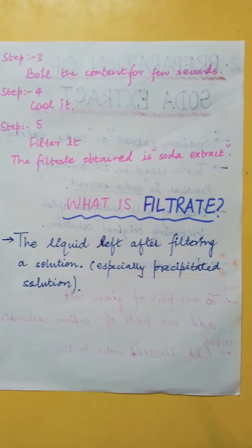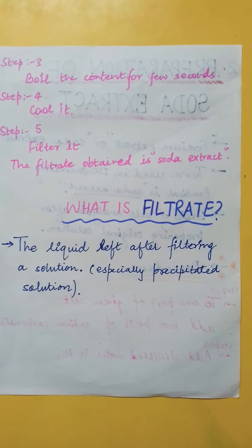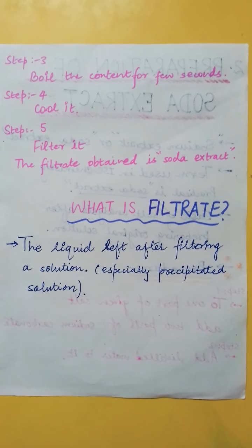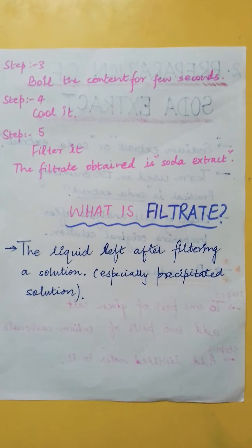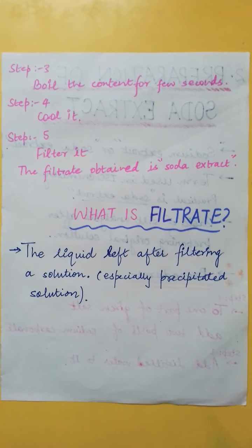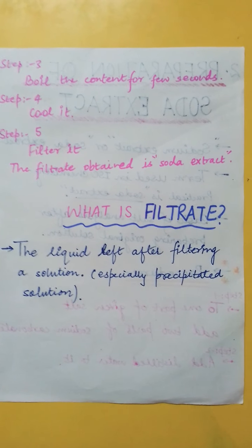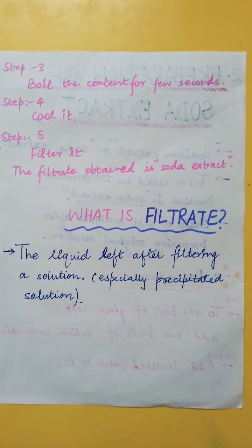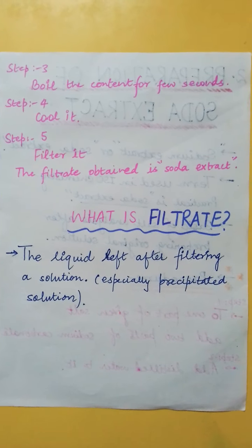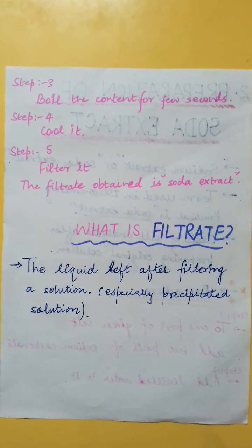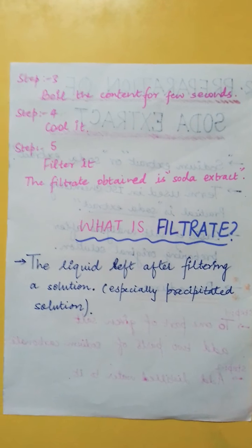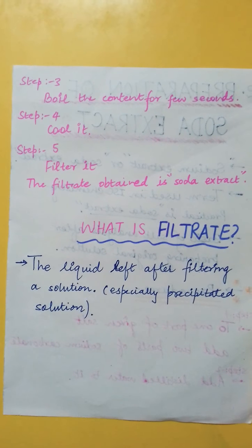Remember, boil it for only a few seconds until the first bubble appears. If it is boiled more than that, you will have difficulty in detecting the salt.